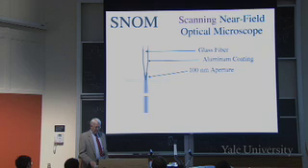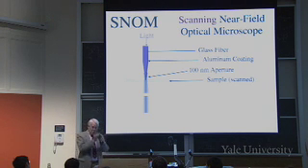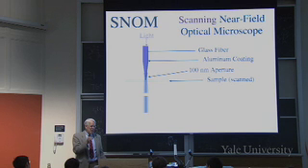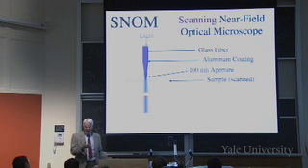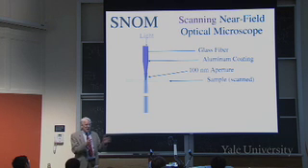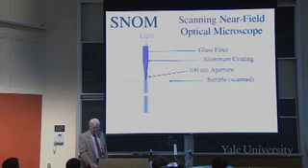So what you do is you have something on the surface of a slide that you want to probe with this, and you send light down the thing. The light comes out through this tiny hole. If there's a molecule there that will take the blue light and emit red light, then you know when it's under the tip. Suppose there was just one molecule on the whole slide. You scan it around until suddenly red light comes out. Then you know that tip is pointed toward that particular molecule.